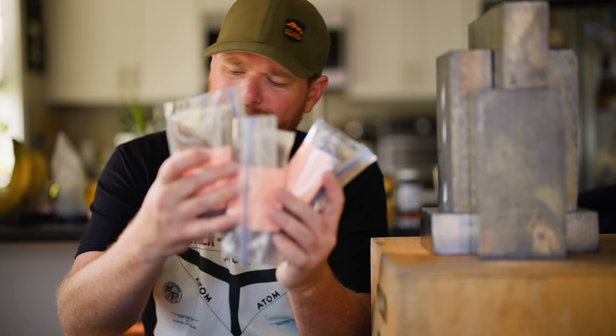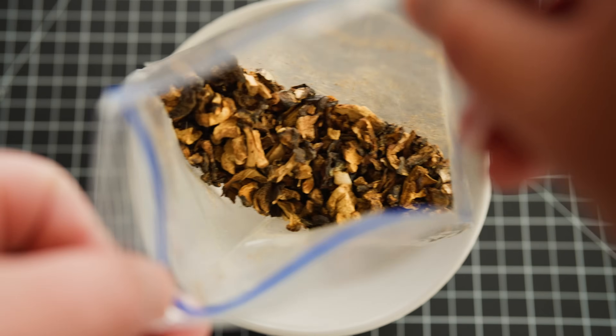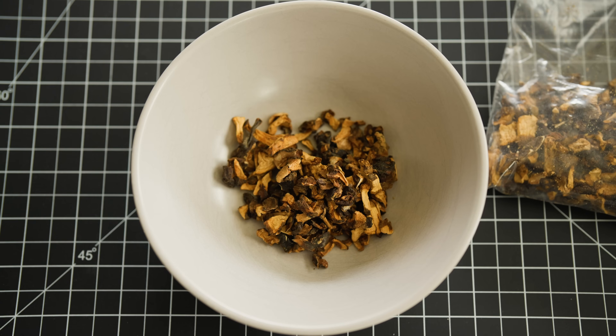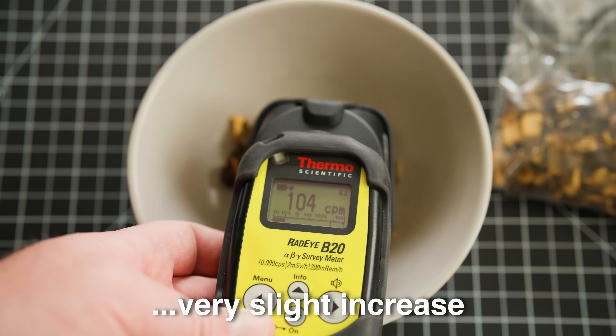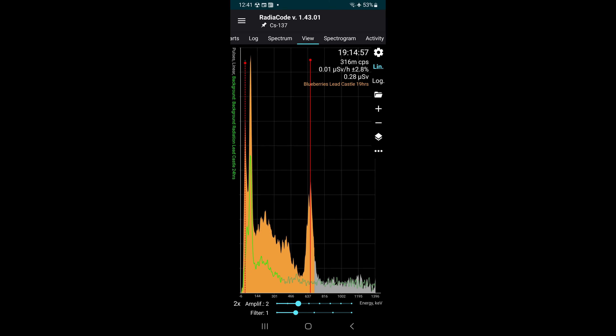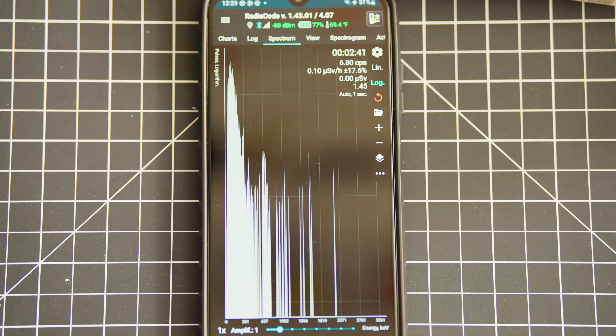These samples actually aren't radioactive in the sense that you'd think to use a RAD-IB-20 to detect them — there's no detectable increase in radiation I can find with that detector on these items. That's where gamma spectroscopy really comes in handy. I ran the gamma spectroscopy data for each one of these from about 12 to 20 hours to get a really clean signal I could show in the video. But you can actually start to see the cesium-137 in these contaminated samples just after about 5 to 10 minutes, which is pretty impressive.